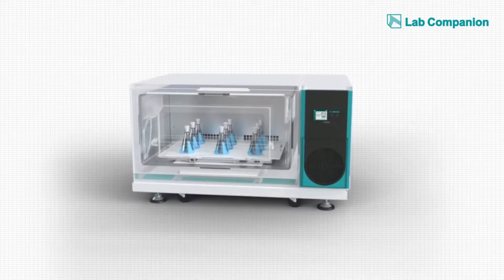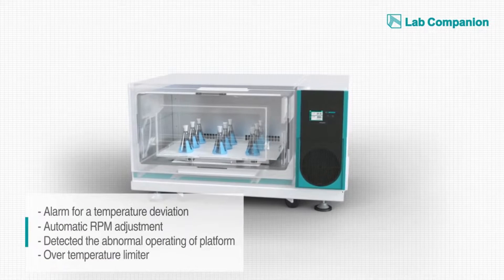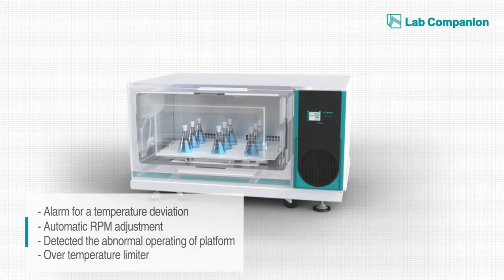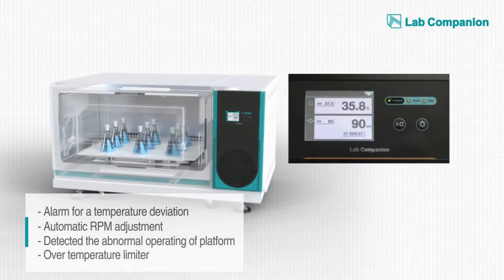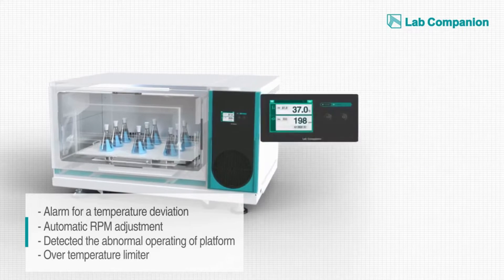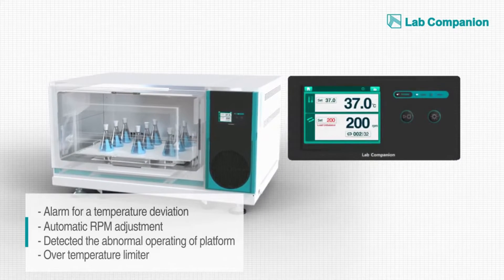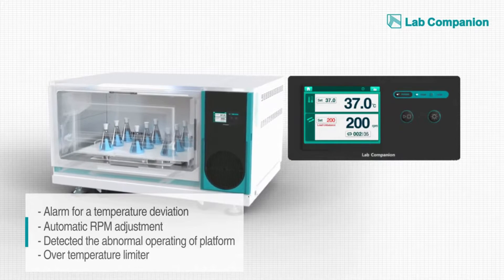The control unit includes a self-diagnosis system designed to protect the experiment and safety from any risks. When the chamber temperature deviates too far from the set level, it sounds a cautionary alarm. When the sample load is higher than the specifications or when the load balance is not right, the control unit lowers the RPM speed automatically.